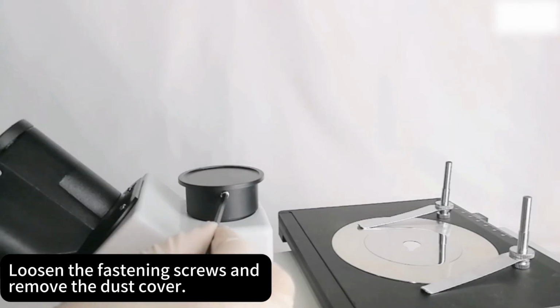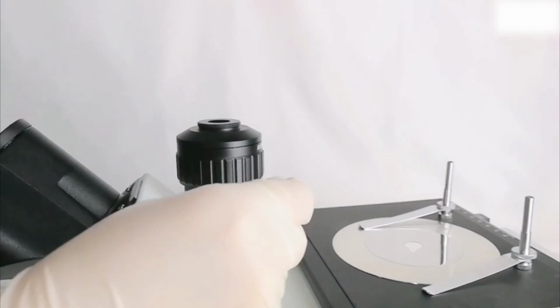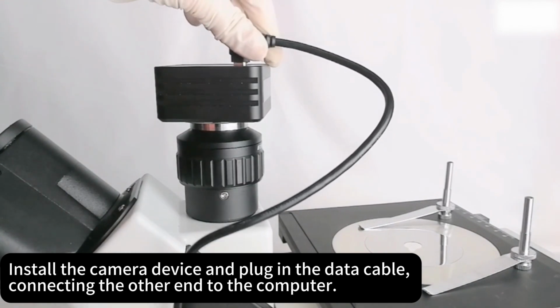Loosen the fastening screws and remove the dust cover. Install the adapter lens interface and tighten the fastening screws. Install the camera device and plug in the data cable, connecting the other end to the computer.